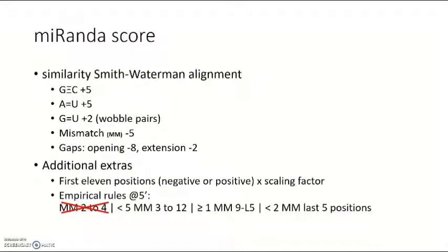The miRanda algorithm applies a similar score, the miRanda score in this case, just like a Smith-Waterman alignment would do in BLAST. Of course, this is similar to Smith-Waterman as we are dealing with a small nucleic sequence, and Smith-Waterman is for local alignment, so it makes sense in that case. But just to clarify myself, there you go.